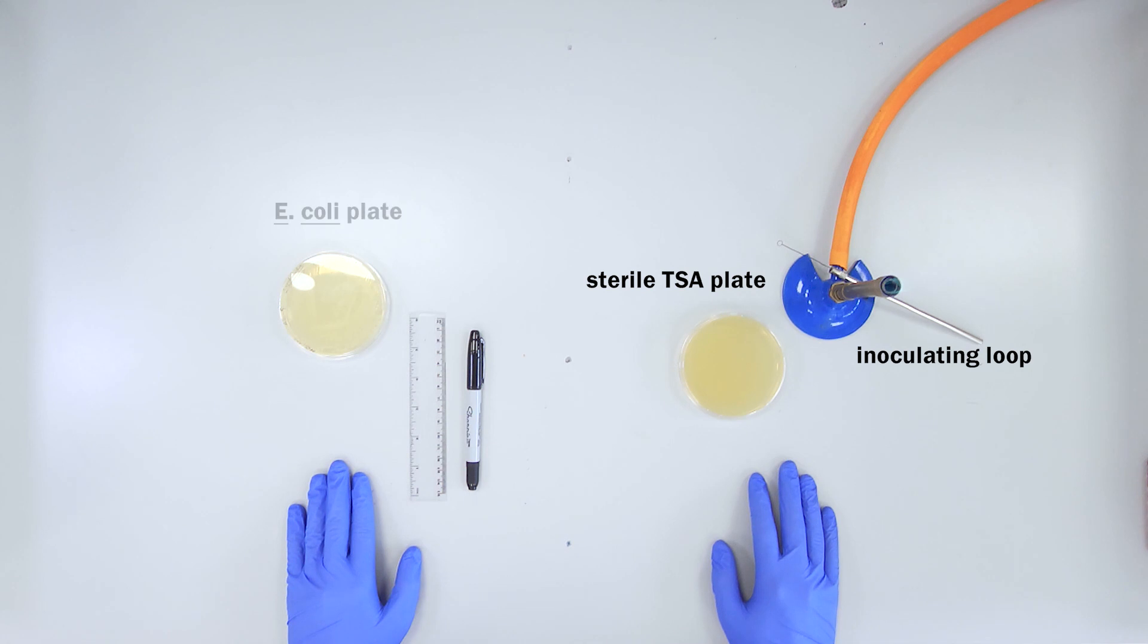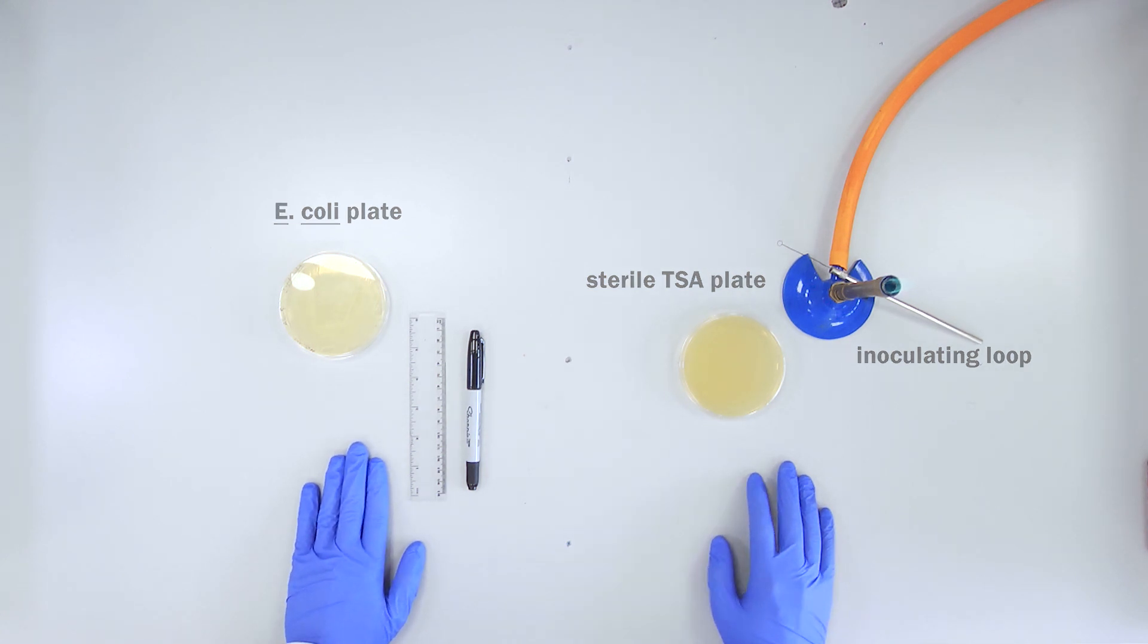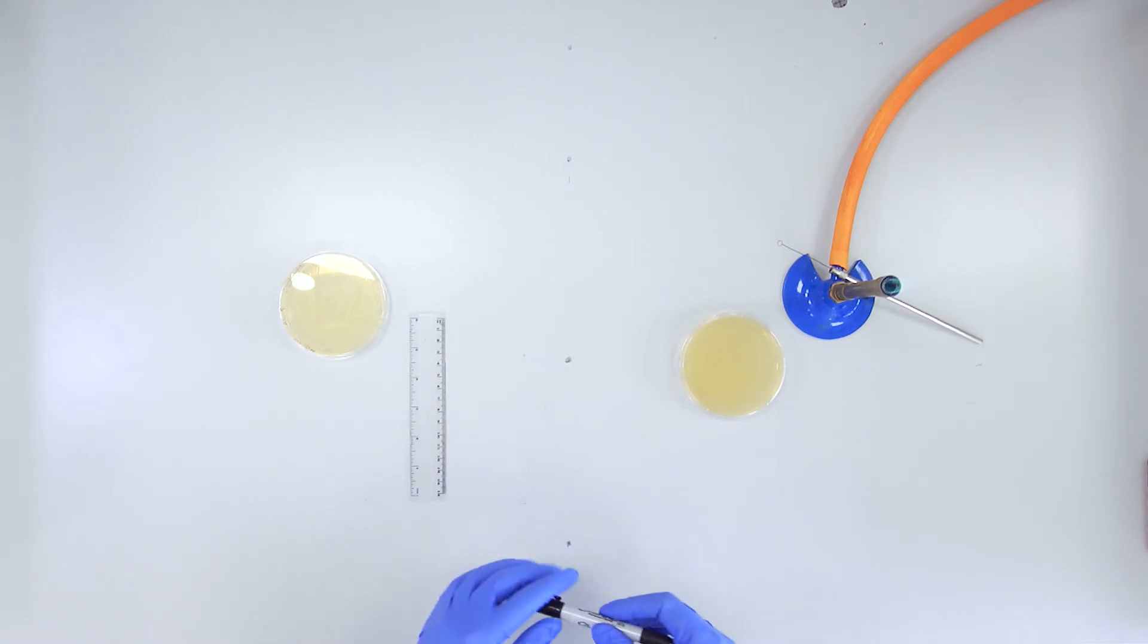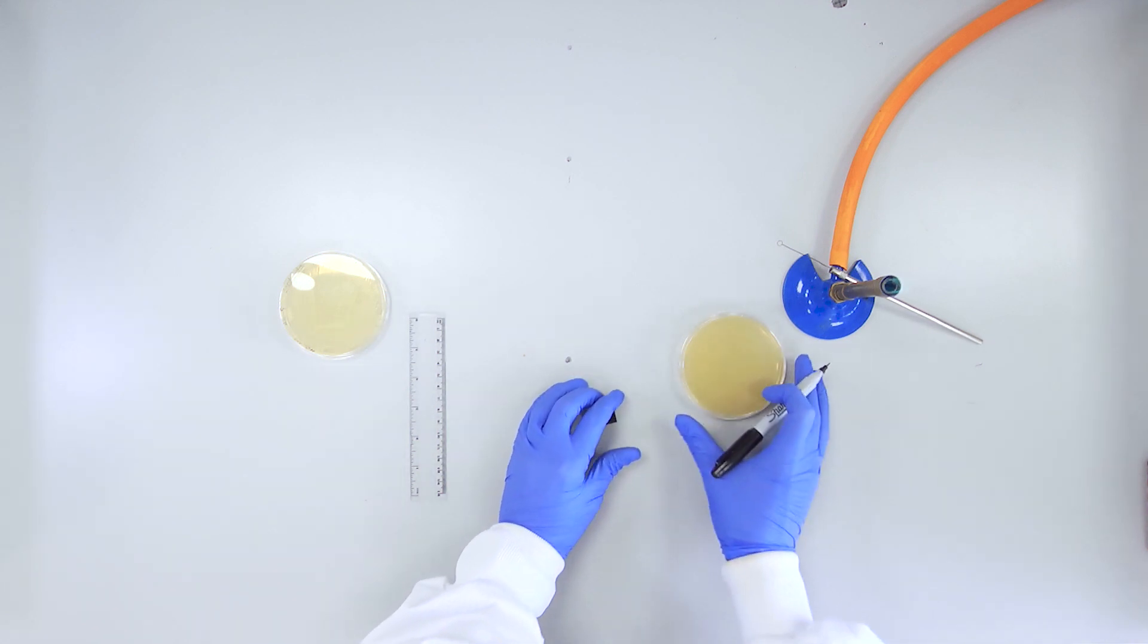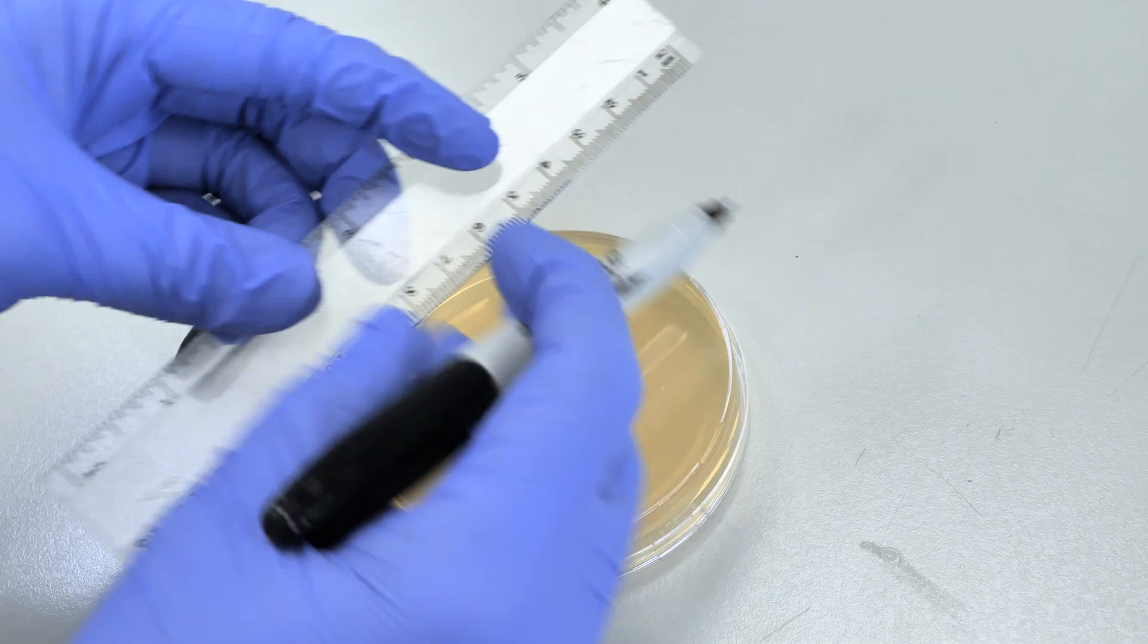a TSA plate that contains isolated colonies of E. coli that has been pre-prepared for you. Before you begin, make sure you are working beside your Bunsen burner, which will help to minimize possible contamination risks.